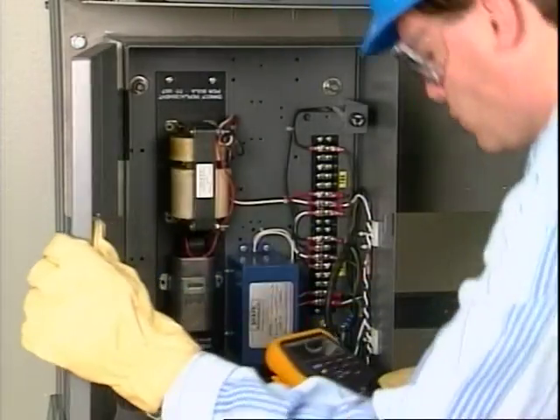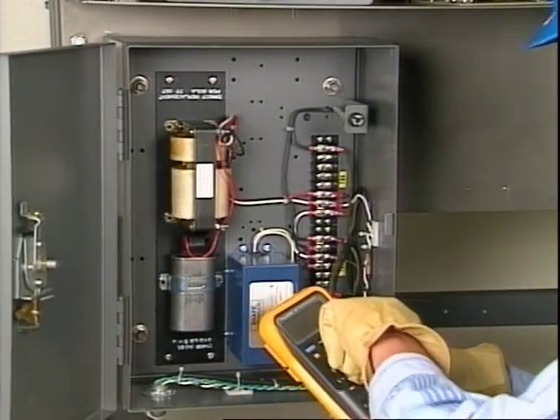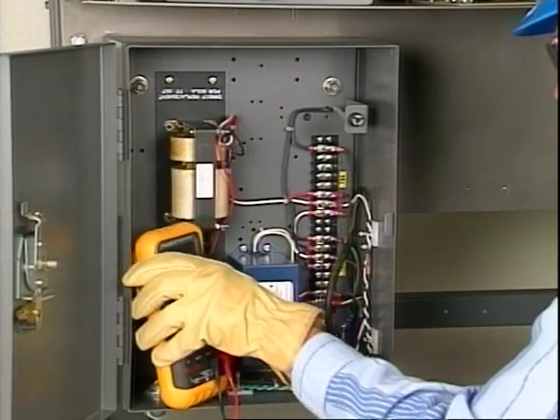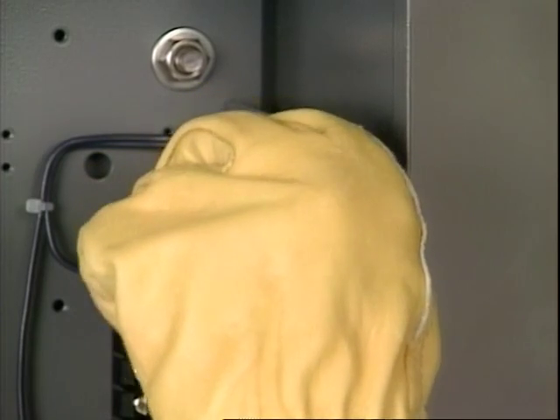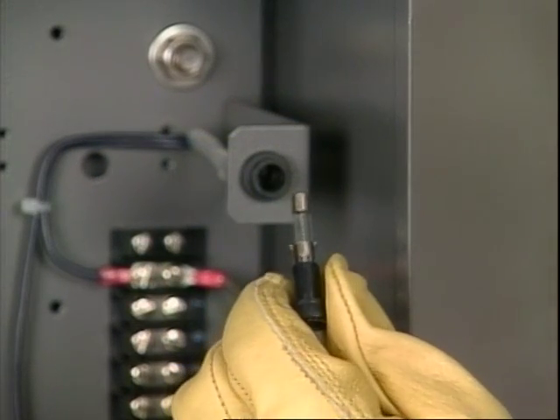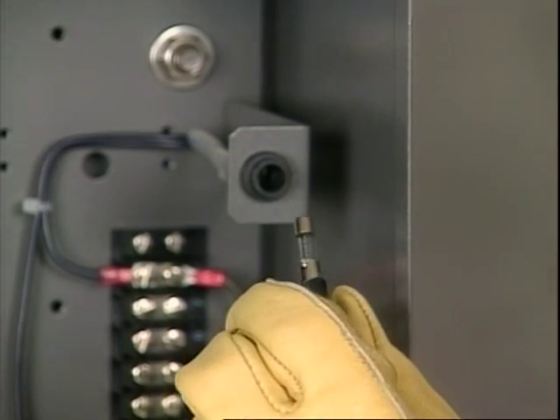The analyzer may have a blown fuse or tripped circuit breaker. Check for voltage through the fuse or breaker. If the fuse is blown, ensure power is turned off and replace the fuse. If the fuse blows again, further troubleshooting efforts will be required.